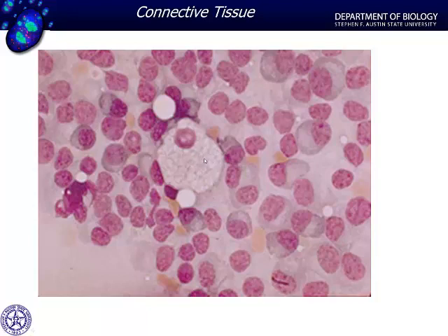You may look at this after we did the multilocular adipose tissue and understand you're not going to have one solitary brown fat cell in a sea of a lot of other cells. If you've got this solitary cell that looks so different, it's likely your macrophage.